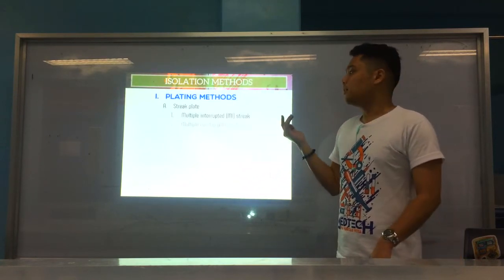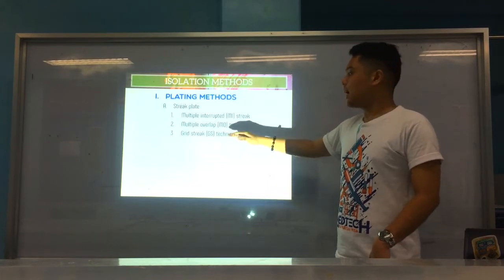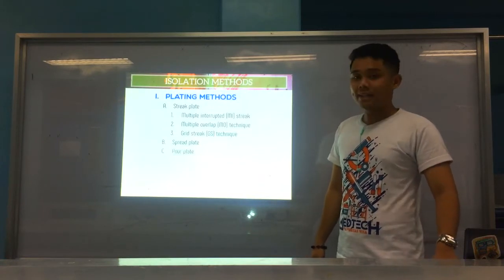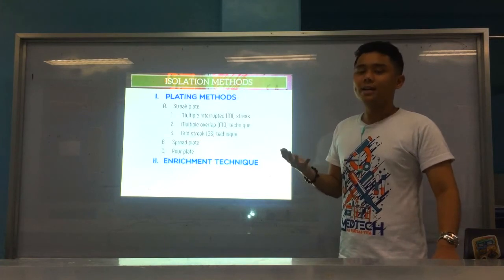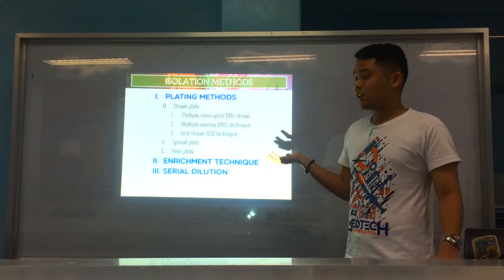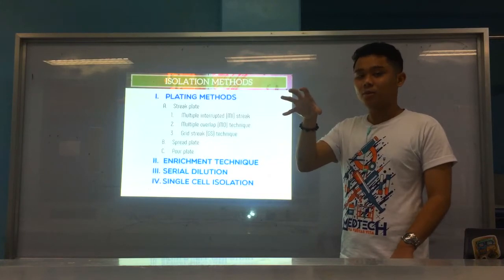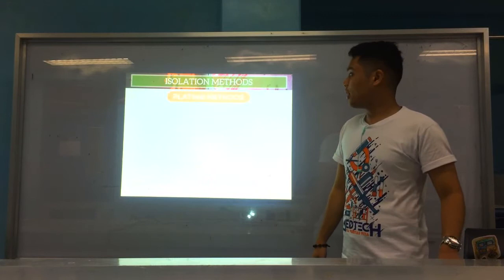So you have different types. You have streak plates. First is your multiple interrupted streak, the most common. Next you have the multiple overlap and grid streak. Next, you have spread plate, okay? And then pour plate. Now, for enrichment techniques, when we want to let a certain organism proliferate first, you have serial dilution, okay? And single cell isolation, meaning you want to isolate only a specific cell or a specific bacterial organism.